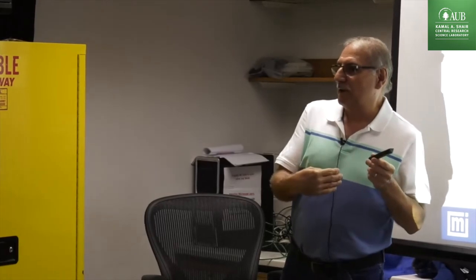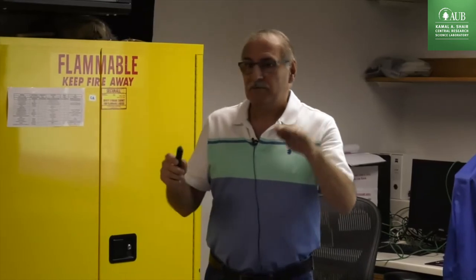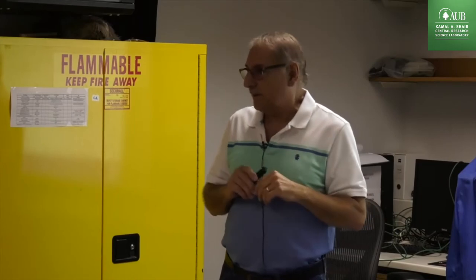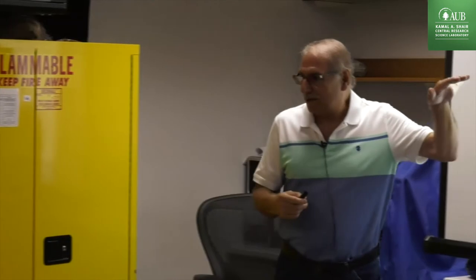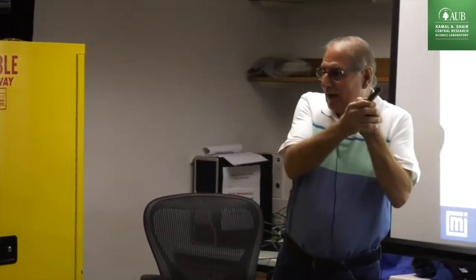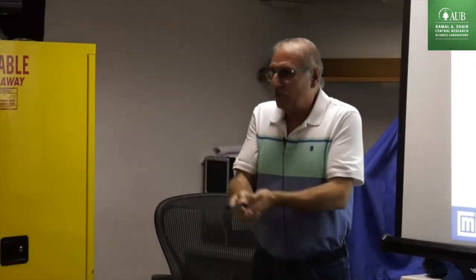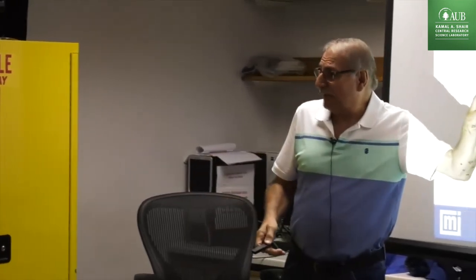I am going to show you an example with ammonia. You have acid sites, and you have sample A and sample B. Sample A has 3 times more acid sites than sample B, but I am not going to work at room temperature. I am going to work maybe at 300 degrees C. The chemical reactions take place between 300 and 400 degrees C at high pressure. My goal is that my acid site has to hold the ammonia at the reaction temperature. If I adsorb the ammonia at room temperature, and when I go to 150 degrees C all the ammonia is gone, then it is not acid for my reaction.